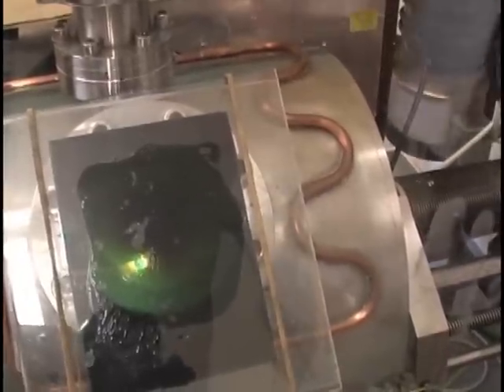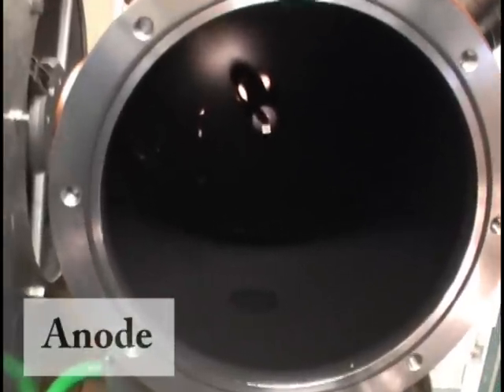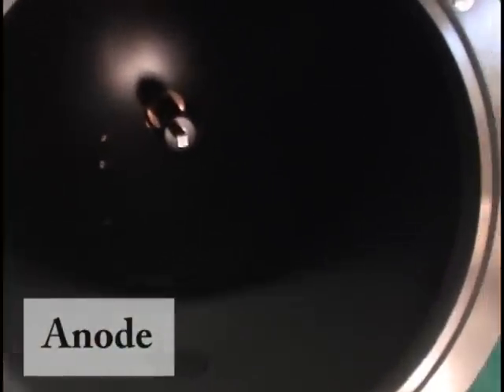Black soot is produced and starts to cover the whole chamber including the window, so after a while we can't see anything anymore. When we open the chamber, we can see how the anode is being consumed and the black powder is deposited everywhere around.